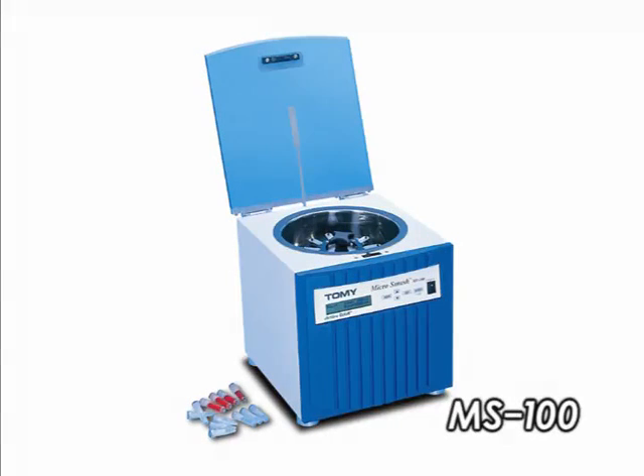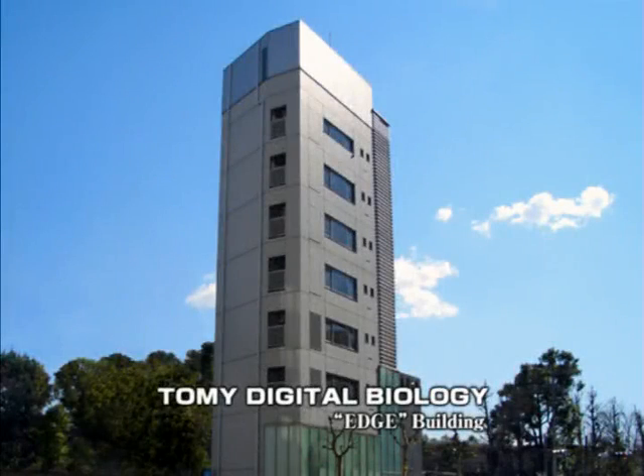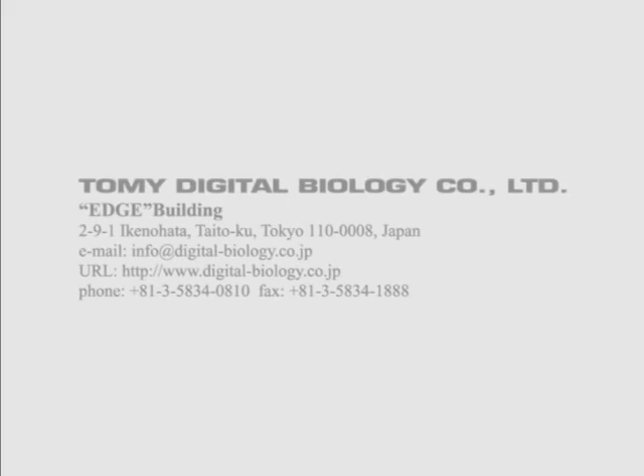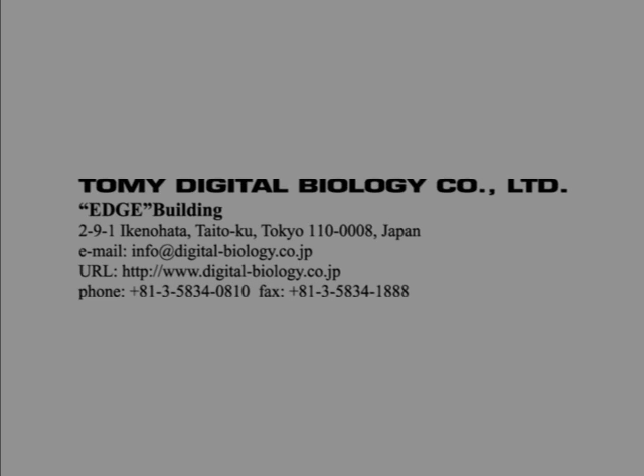For further information on the MicroSmash MS100 and its application examples, please contact your local Tommy dealer.